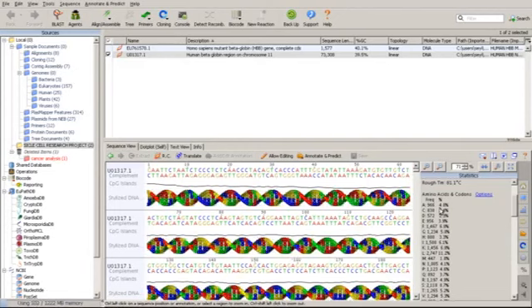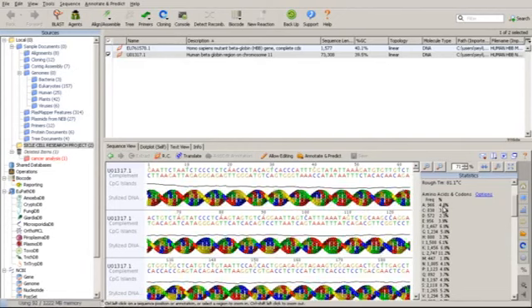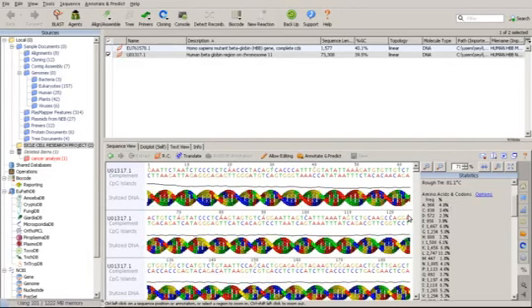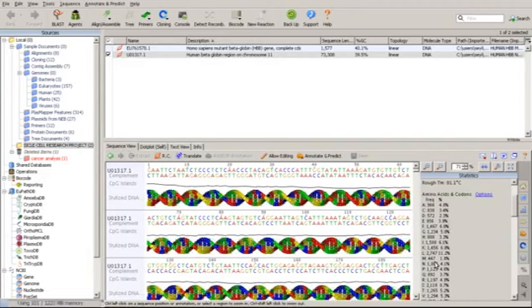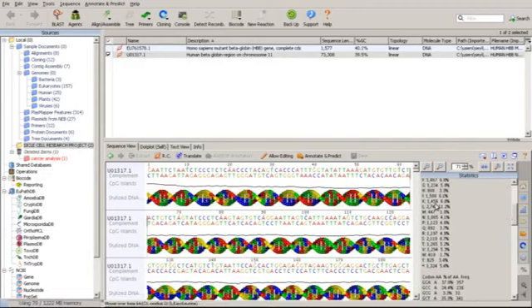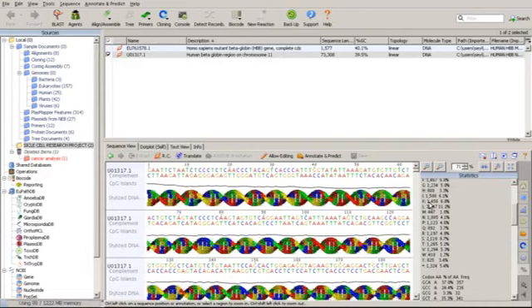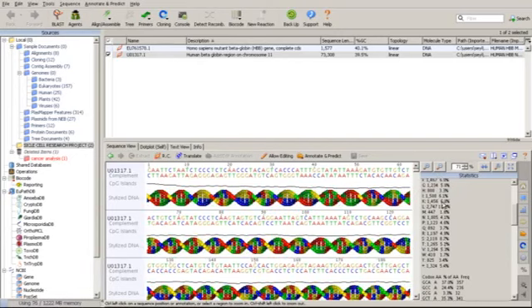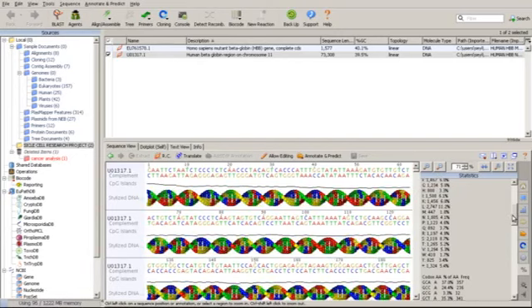That means alanine is about 4% of the whole sequence. They do the same for all amino acids here. These are the numbers at which they occur, and these are the percentages. Now we have that of codons too.